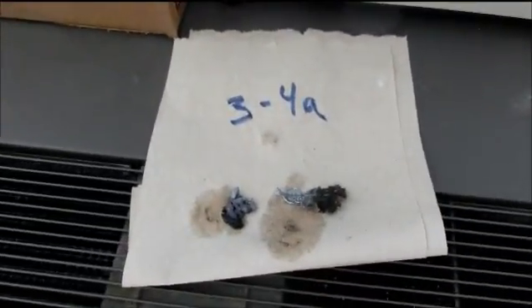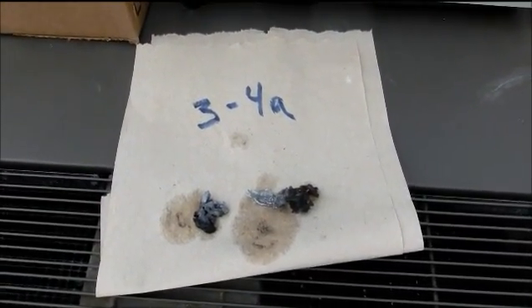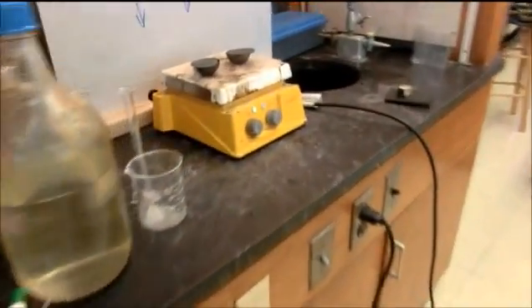In the meantime, the chunks of zinc are sitting on top of the air conditioner so they can get blow dried on top of the paper towel — that is for 3B4 and this is for 4B5. We will let those completely dry before we weigh them.